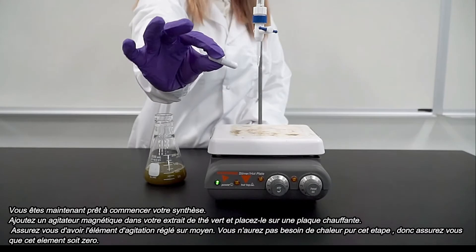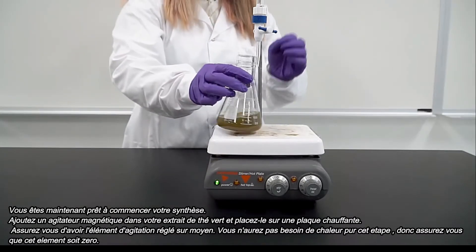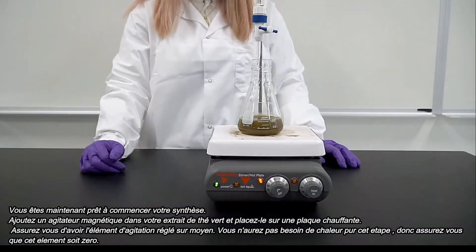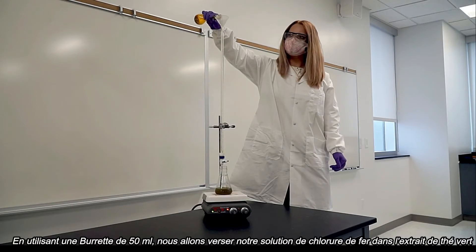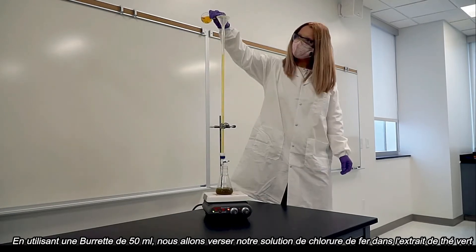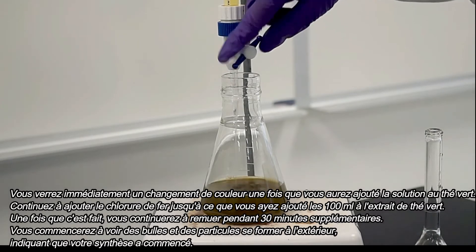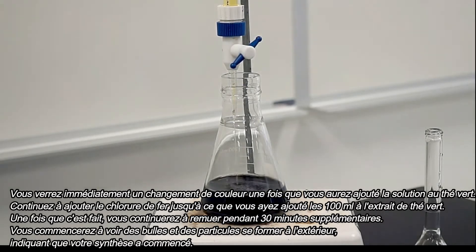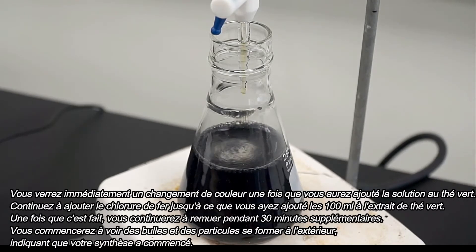You are now ready to begin your synthesis. Add a magnetic stirring bar into your green tea extract and place onto a hot plate. Make sure that your stirring is on medium. You will not need heat for this step, so make sure that element is at zero. By using a 50 milliliter burette, we will dropwise add our iron chloride solution to our green tea extract. You will immediately see a color change once you begin adding your solution to the green tea. After you have finished adding your 100 milliliters of iron chloride, you will continuously stir the solution for 30 minutes. You will start to see bubbles and particles forming on the outside, which indicates that your synthesis has begun.